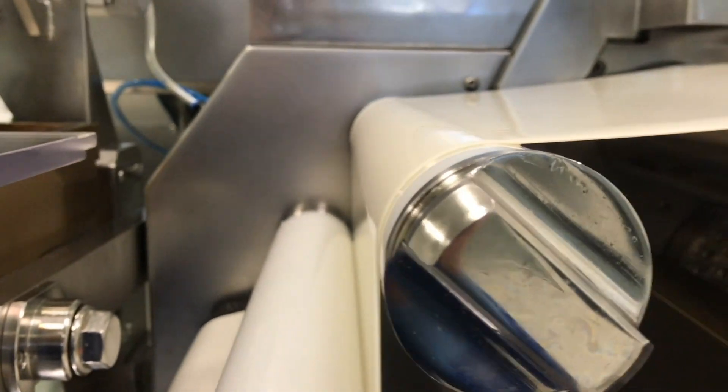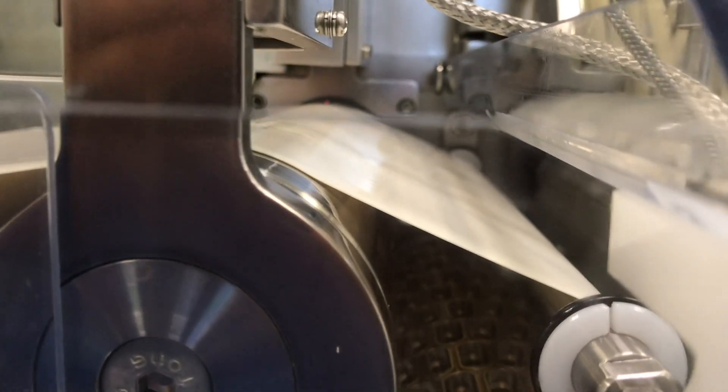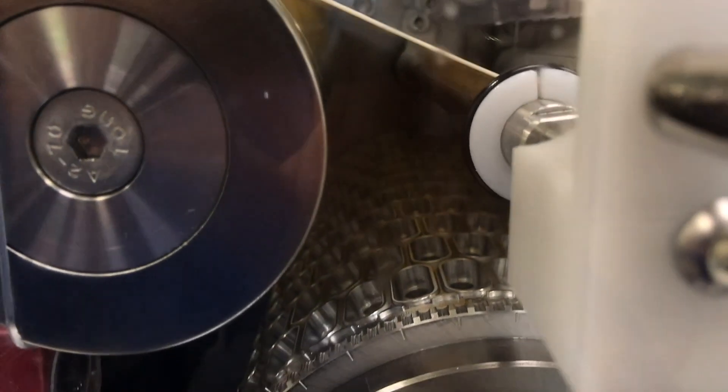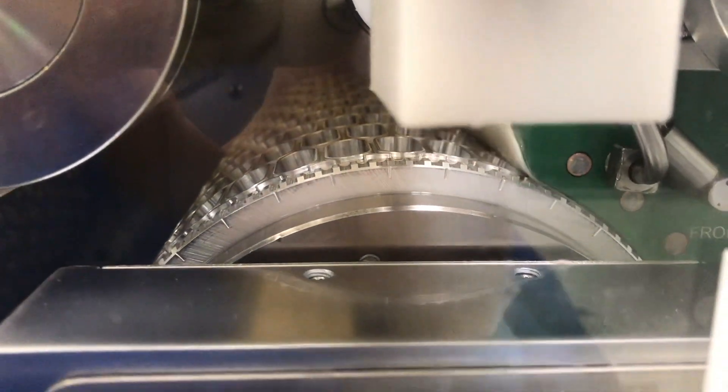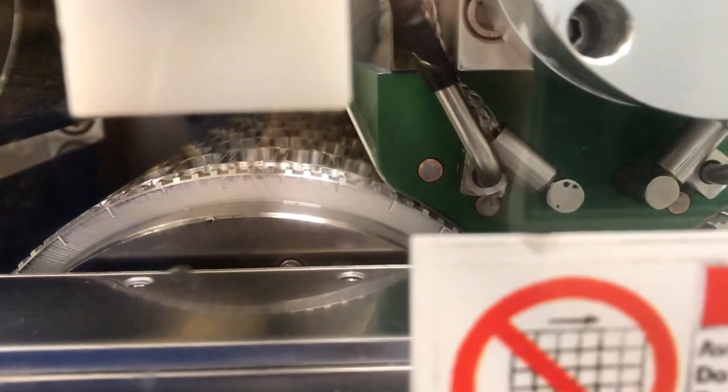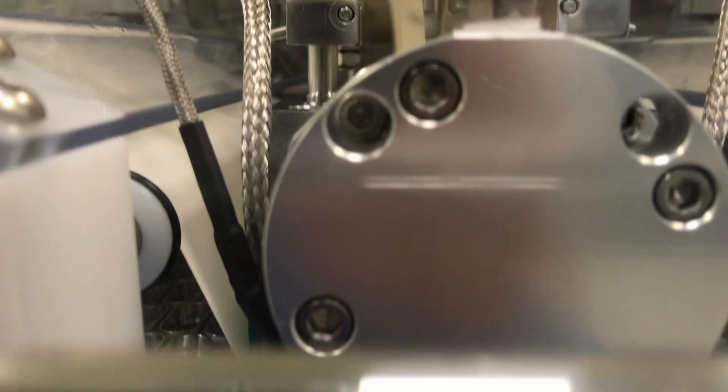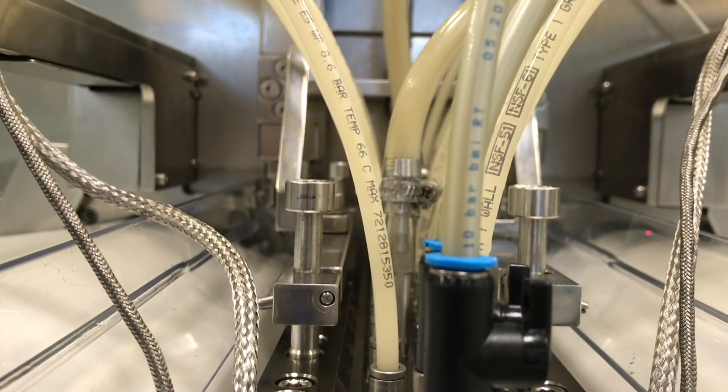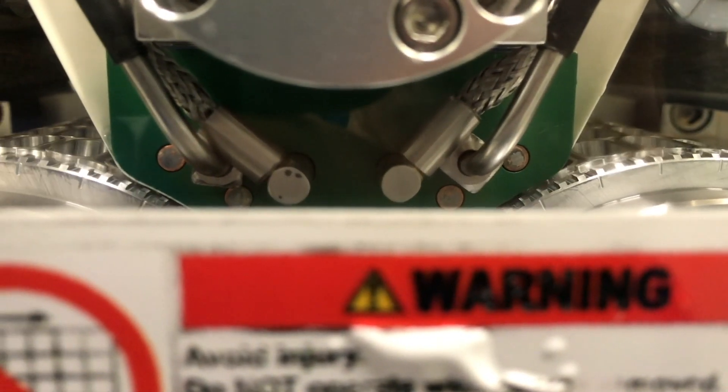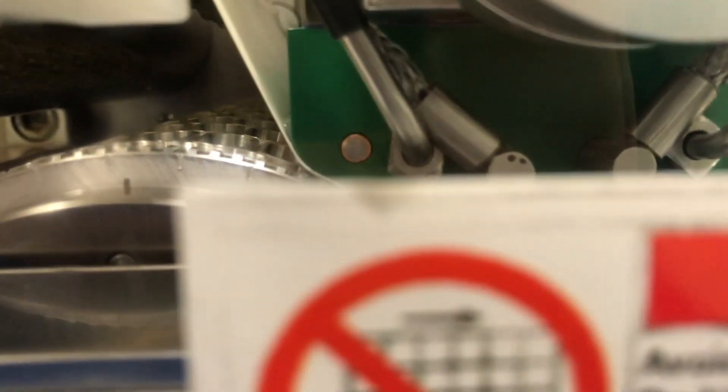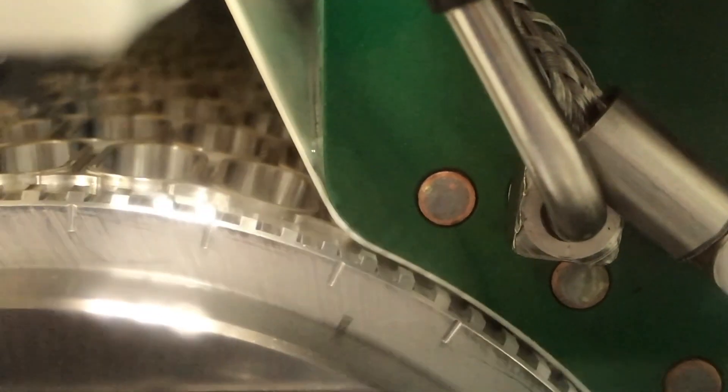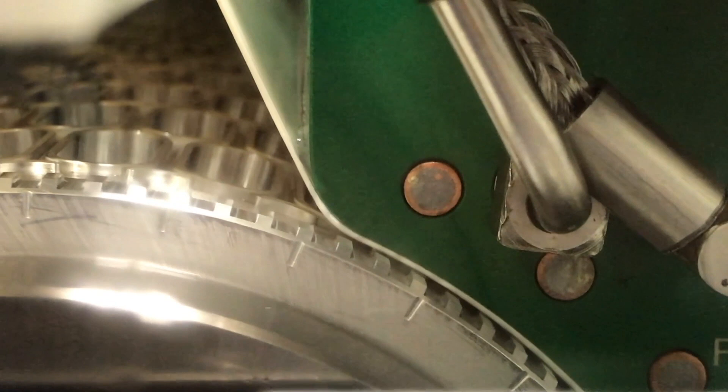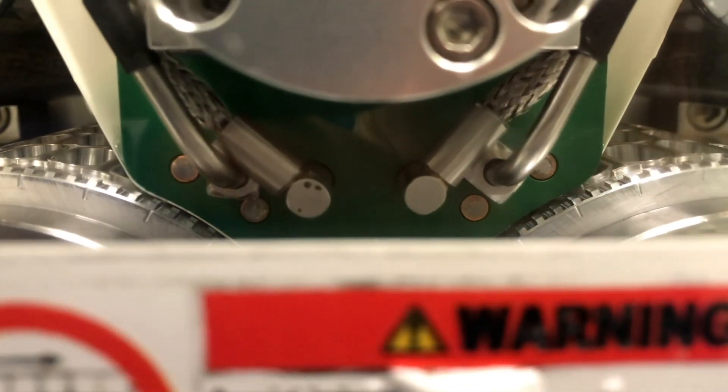These rolls apply the lubrication so that it doesn't stick. And this is now the heart of encapsulation, the rotating die rolls with the wedge and the gelatin ribbons in between. From top you see now the fill mass being pumped through the wedge, and here you see the rotating die rolls, in this case with 2 RPM. And at that time the gelatin ribbon is being heated up on the wedge and being made ready for encapsulation.